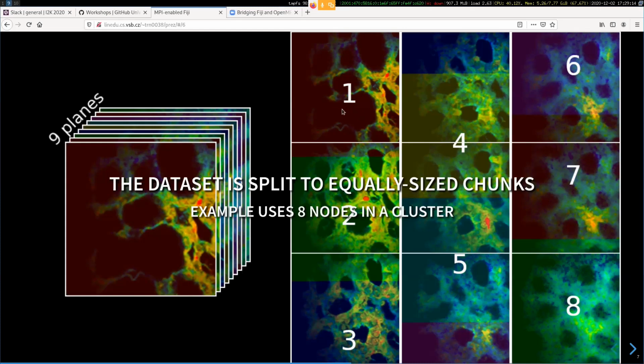But the calculation may not take the same time for all chunks. For example, elements around the boundary may require more time because of a different code path, or there may be some condition that can make it take a longer time.